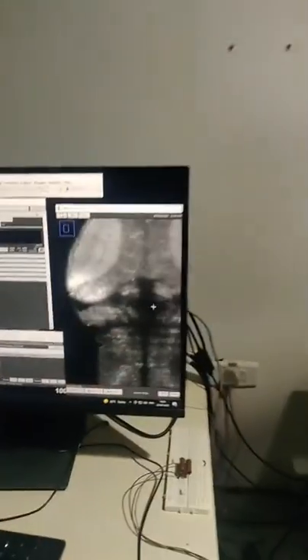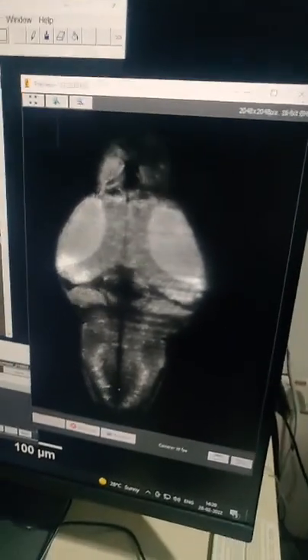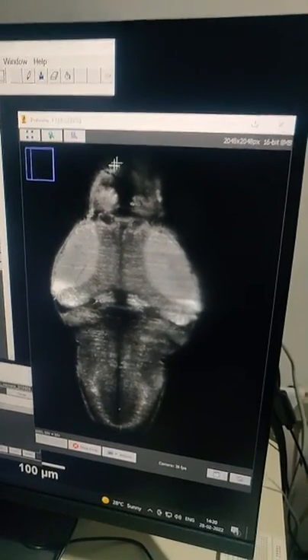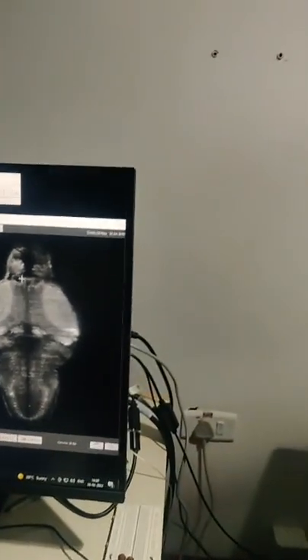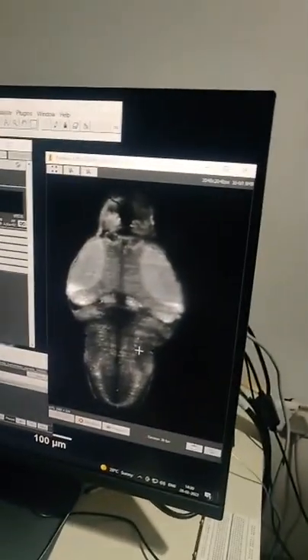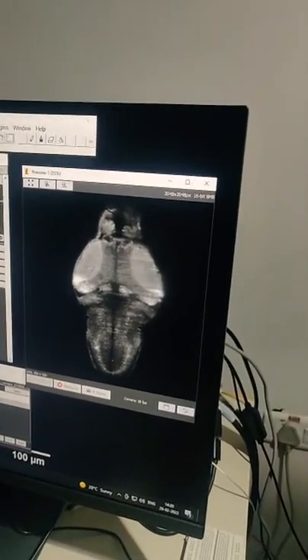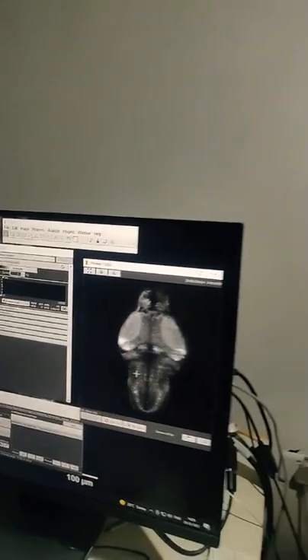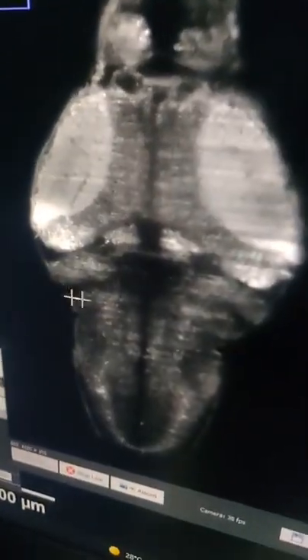Okay. So we can actually go through the parts of the brain here. Sure. If I move it up a little bit, we have the forebrain here. This is the optic tectum, and it gets visual inputs. Okay, visual. So the eyes in this fish would be here. Yeah, there's one eye here, one eye here. So this part is related to the fish's vision. Exactly. And then this is the cerebellum.